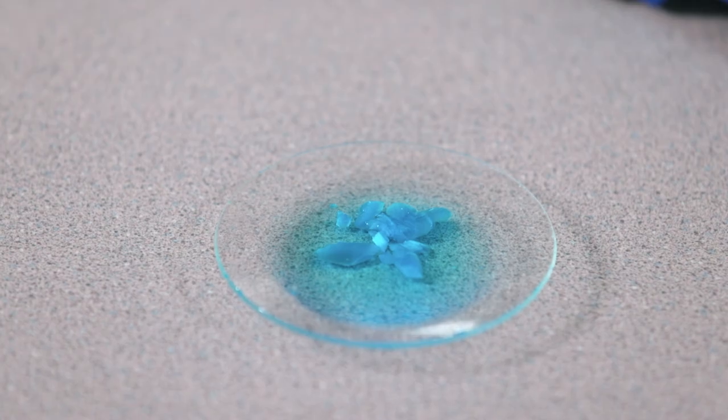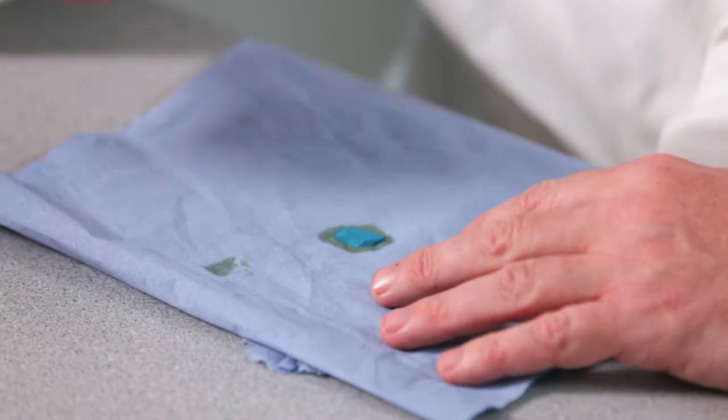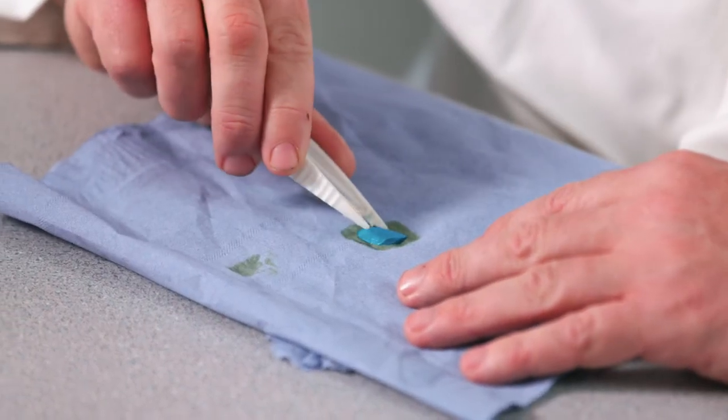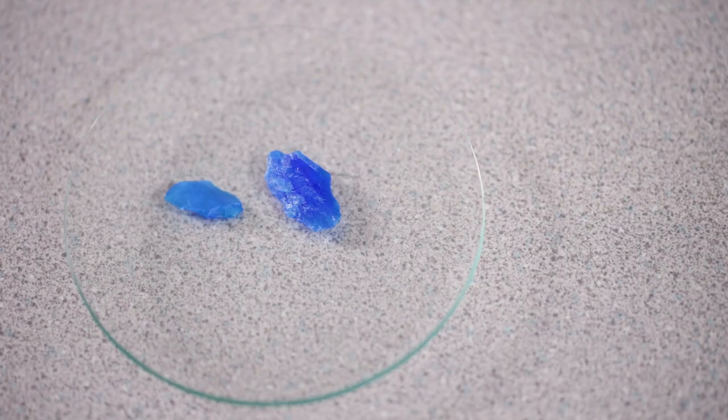The crystals can be carefully removed from the solution by using tweezers and then dried on a paper towel. Take care not to wash these crystals as copper sulphate is soluble and your crystals will soon vanish back into the solution.